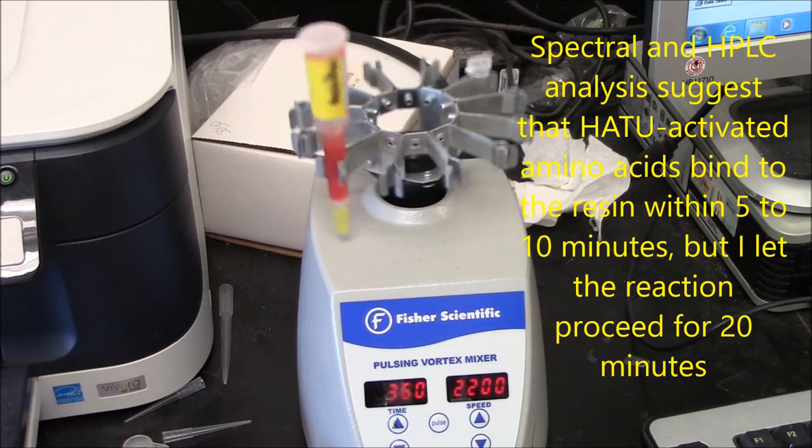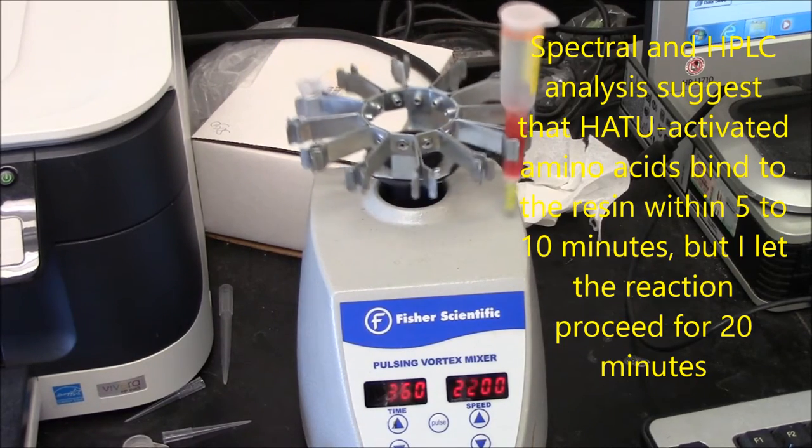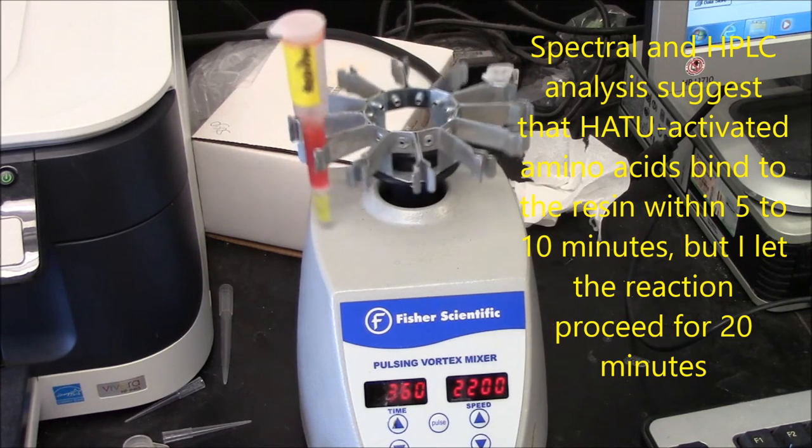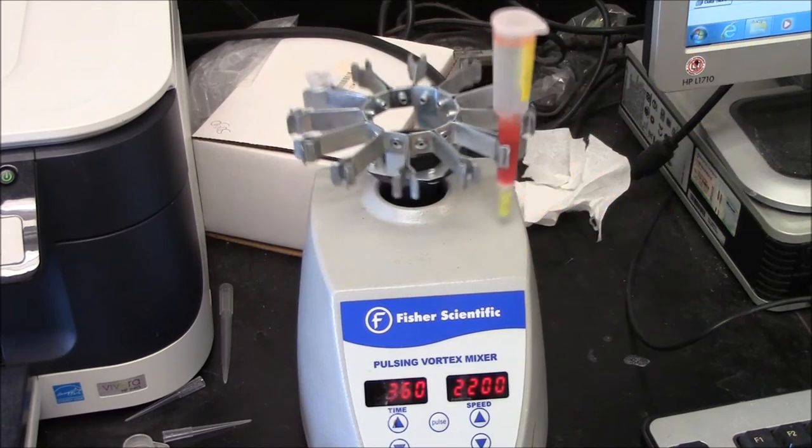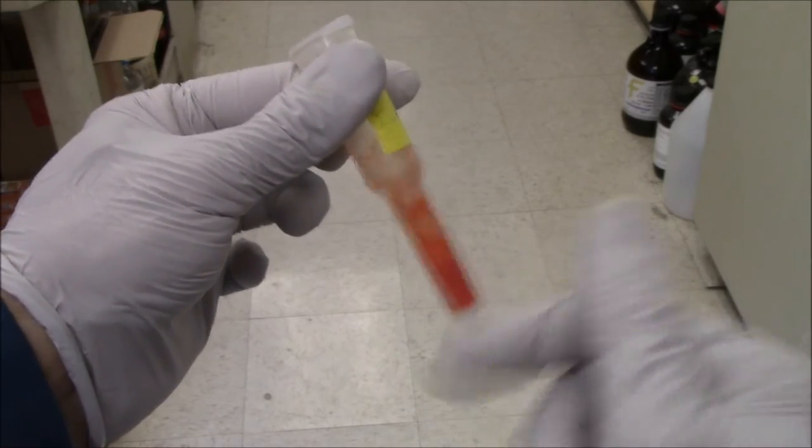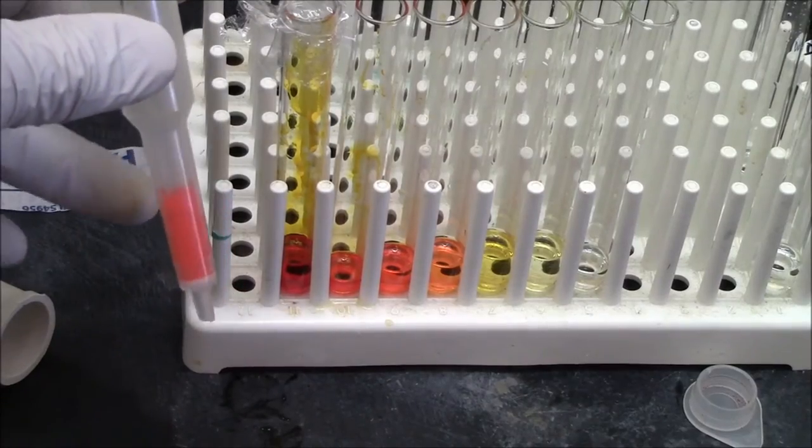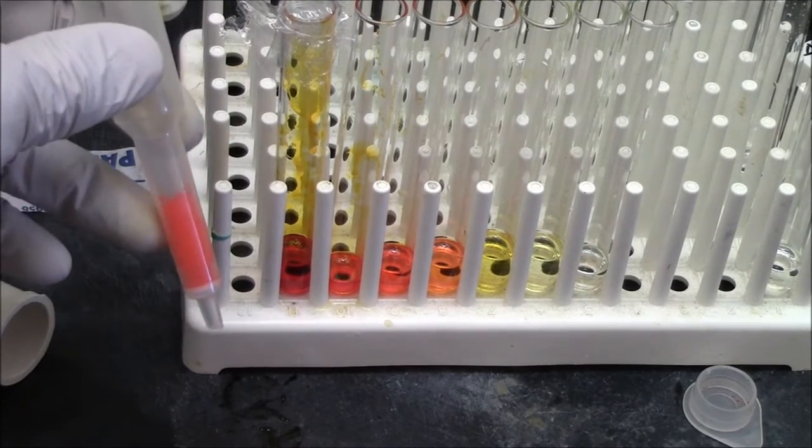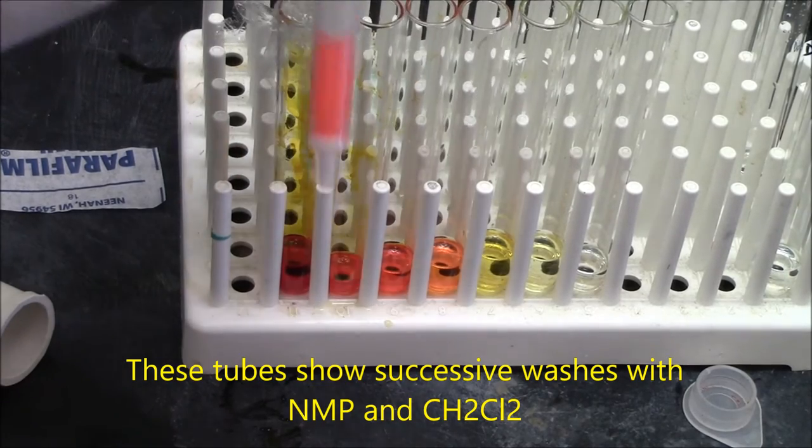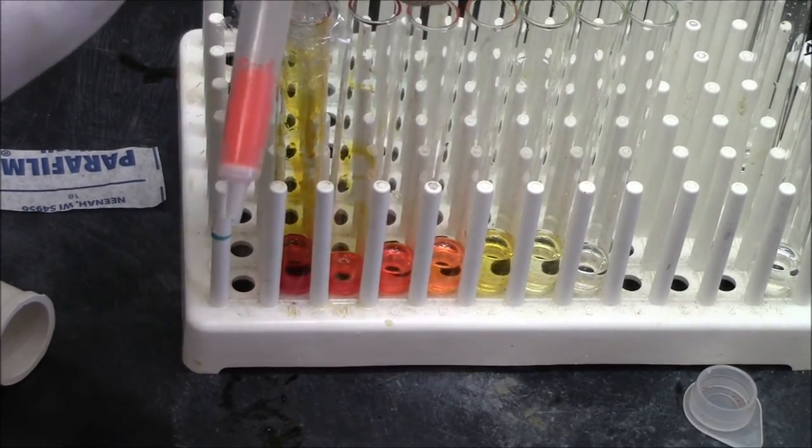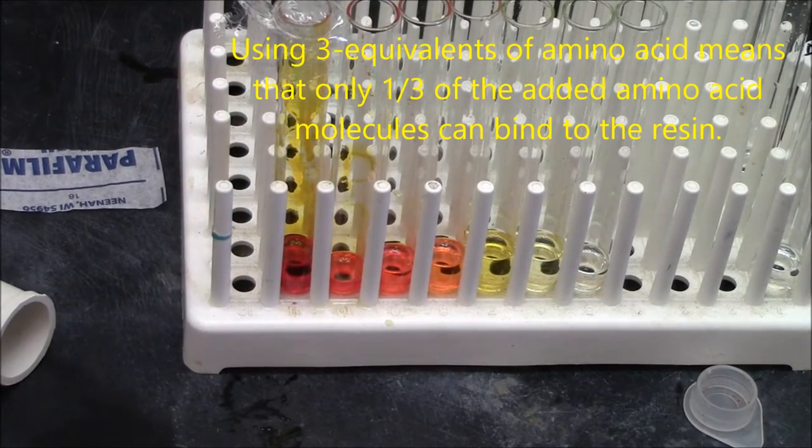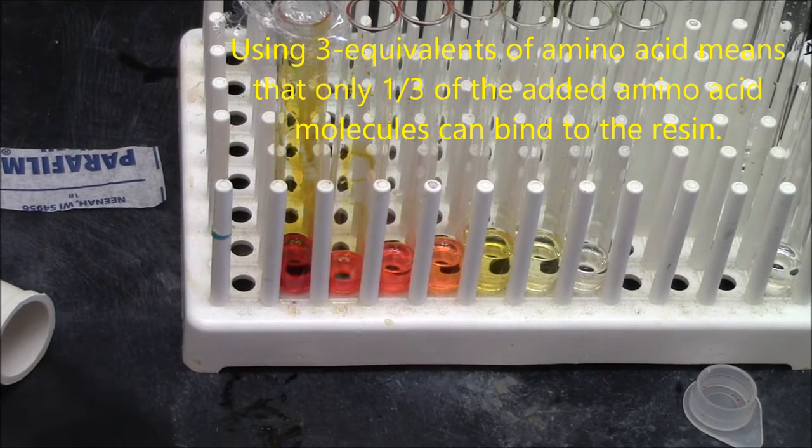Once I've suspended the beads manually, then I put them on this vortexer at 2200 RPMs. I will still need to resuspend manually every few minutes because the beads will settle. This is what it looks like when the beads settle and a little agitation can get them resuspended. After 20 minutes, I drained the excess Dapsyl lysine and washed the column with NMP and dichloromethane. Although you can see I did wash away quite a bit of excess Dapsyl lysine, the column is still red. That's the covalently bound amino acid. So I washed away all the free Dapsyl ligand.